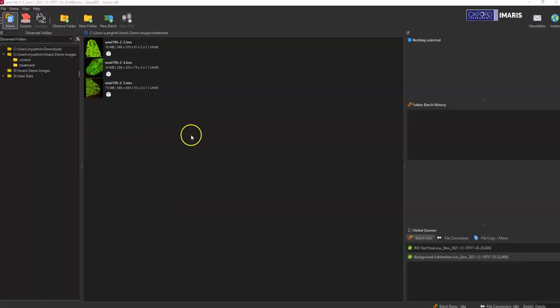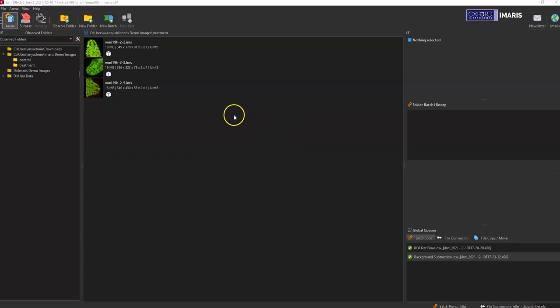Hi, so I'm going to show you real quick how to add a specific region of interest and then apply that region of interest to a batch.